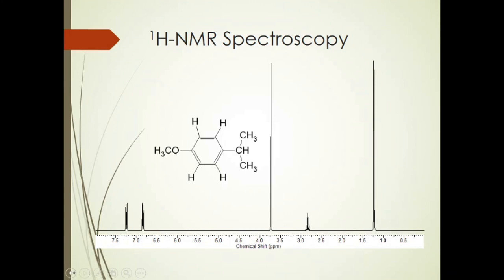This is the sort of analysis that you need to do when you are analyzing your spectrum, and you need to report this. Walk through this procedure, not quite in this detail, but you do need to walk through it when you are writing up your conclusion.